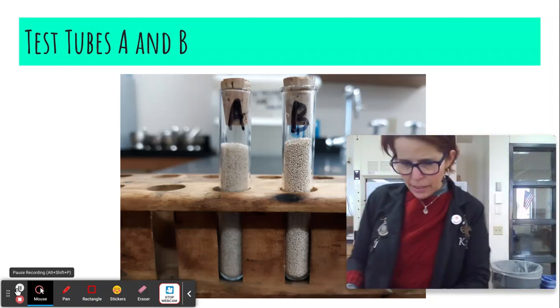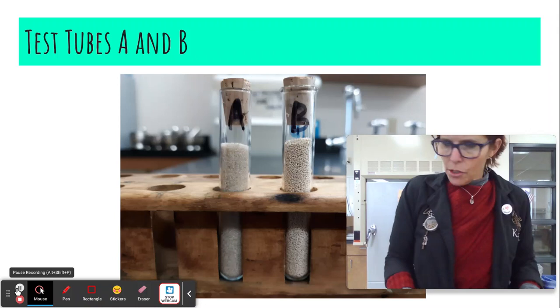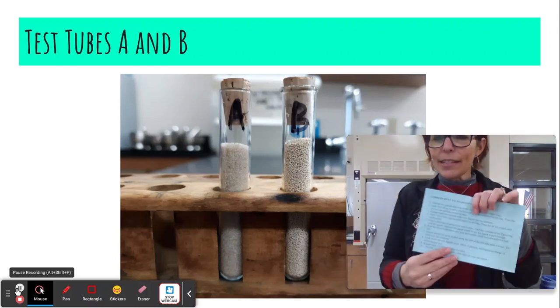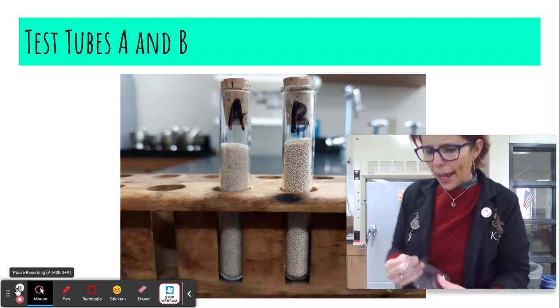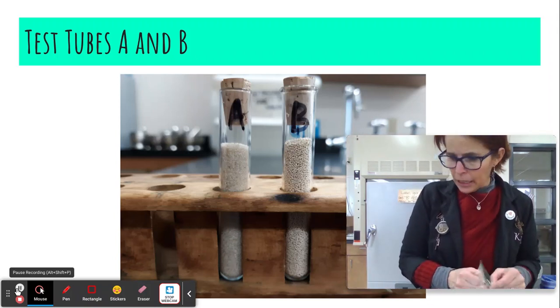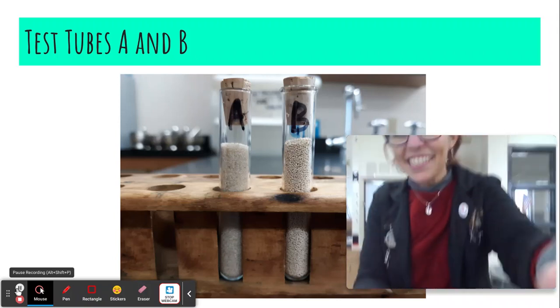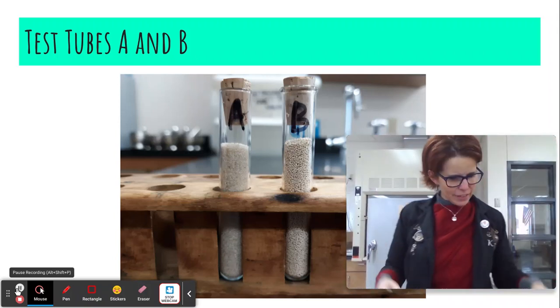So I don't know if I have all my supplies that I need, but we'll try it. So I got to grab my directions. So for DNA, it starts out exactly the same way. It says add all of a sample. Let me pause for just a second. All right, sorry about that. I'm just trying to get all my materials together. There's a lot for these labs.